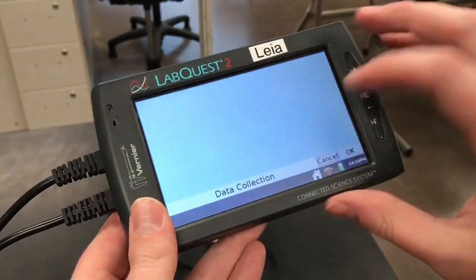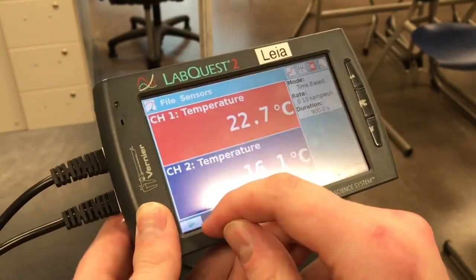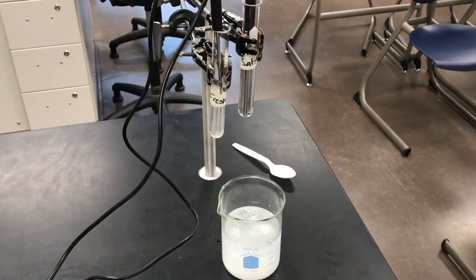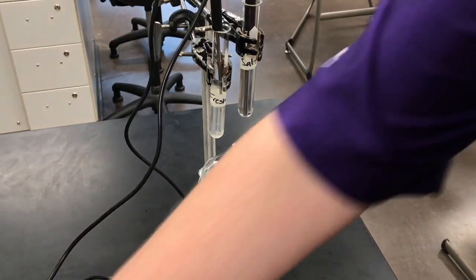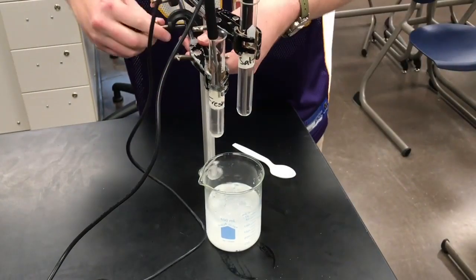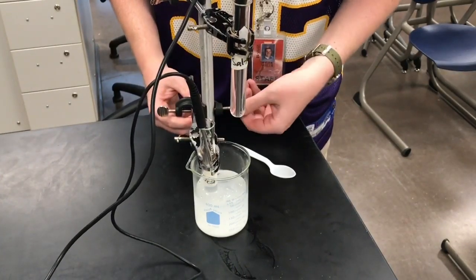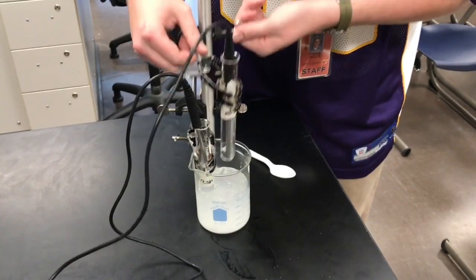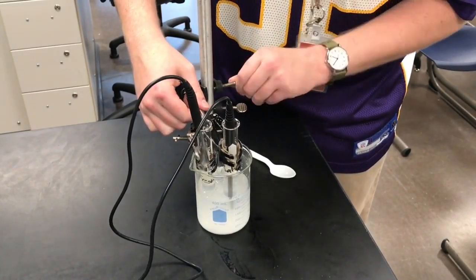As soon as we do that, I'm going to hit play on my LabQuest. And as soon as I do that, I want to lower my test tubes into the saltwater bath. You don't need this to hit the bottom, just enough so that you get the water in your test tubes fully submerged.